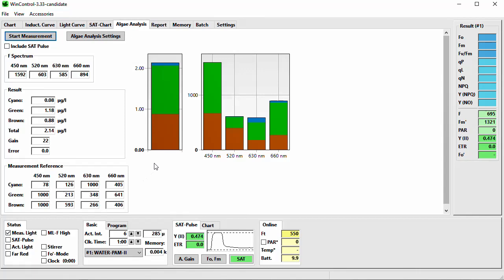The wavelength-dependent fluorescence excitation characteristics of the applied references are listed below, with their fluorescence spectra normalized to the wavelength showing the highest fluorescence value. These references are used to fit the measured fluorescence as well as possible, solving the task of which algae group needs to be in which proportion to obtain the measured wavelength-dependent fluorescence values. The contribution of each algae group to the overall signal is illustrated, resolved into the four applied wavelengths. The sample composition is given in µg chlorophyll A per liter for the three algae groups and a total sample concentration. The quality of the fit is given as the least square error — the better the references fit your sample, the smaller the error.